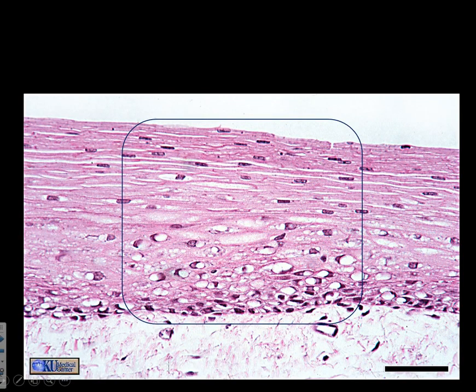Here we go, guys. What do we think? We've got an apical surface and a basal surface. So we're looking at epithelial again. And the cells here, like here's a cell, right? With a nucleus, another cell with a nucleus. And as you go further down or deeper into this tissue, the cells get a little plumper looking.